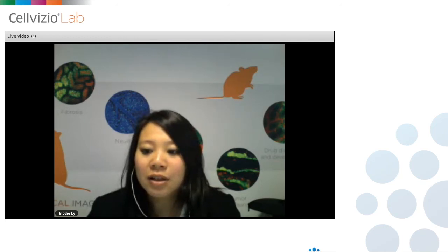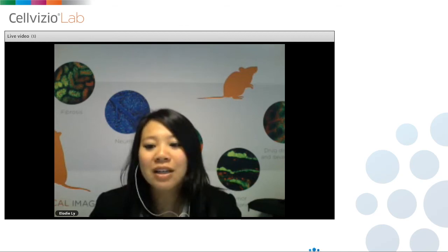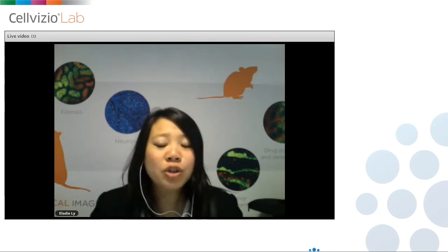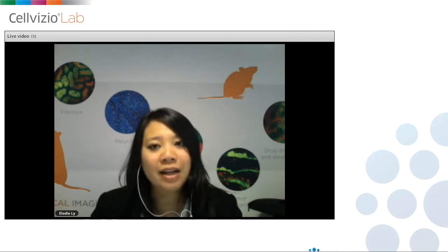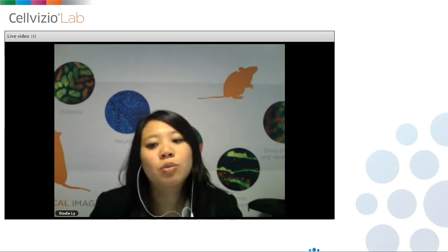I have another question still regarding exploring deep brain vessels. How can we insert the probe in the hippocampus? What you can do is, if you are working on the anesthetized animal, you can use a stereotaxic frame, open the skull of the animal, just a small opening, and then the probe can be inserted. So using the stereotaxic frame, using very precise coordinates to the specific area that you want to image.